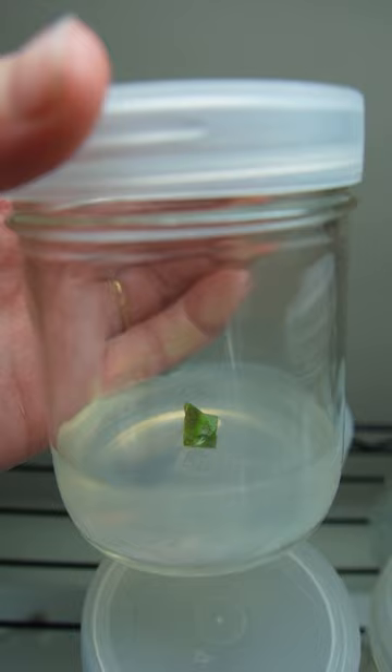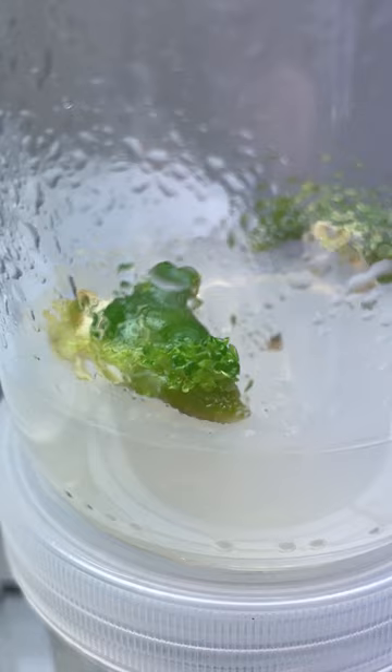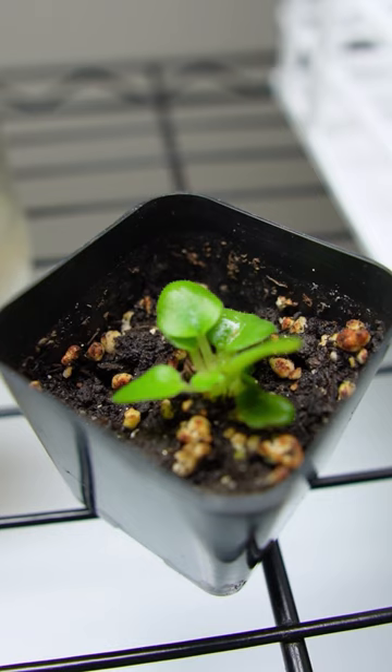After placing a piece of plant tissue in the tissue culture media, baby plants will begin to form in approximately four weeks. The baby plants will be exact clones of the mother plant, and once the baby plants are large enough, they can be acclimatized to soil.